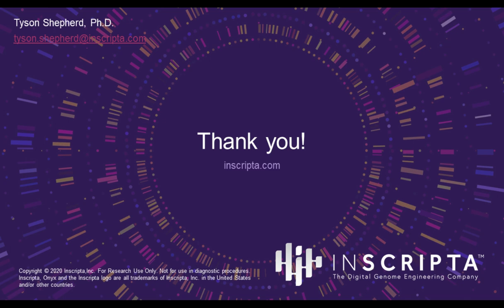Thank you. So the way that occurs is that because you're starting with an engineered population, so going through the workflow mentally, you've gone onto the portal, you've made your designs and interacted with the genome and come up with a set of designs that you're interested in, be it of a particular protein or set of proteins or pathway that you're interested in, but maybe across the whole genome.